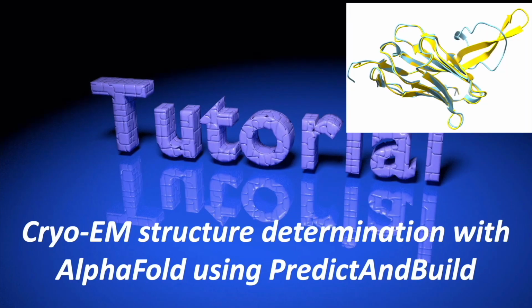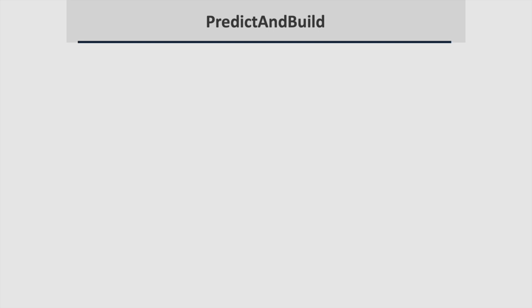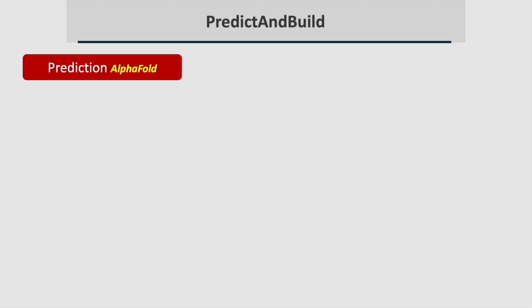This tutorial will show you how to carry out Cryo-EM structure determination with AlphaFold models in Phenix using PredictAndBuild. Here are the steps in solving a Cryo-EM structure with PredictAndBuild. First, the structure of each chain in your molecule is predicted with AlphaFold.